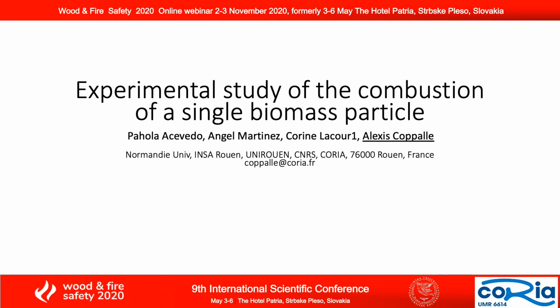In this study, we have developed an experimental setup which allows us to follow the combustion of a single biomass particle. This makes it possible to follow the different steps of the particle decomposition under heat flux, mainly the drying, the pyrolysis and the flame period, and the char oxidation.